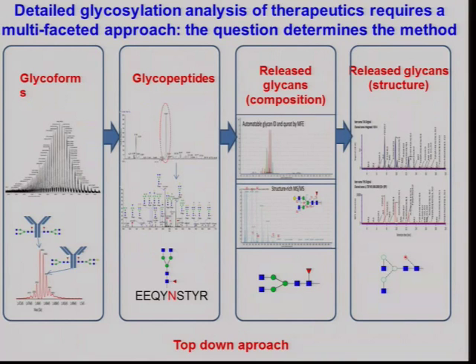This is just one arrangement of these glycans. And it will give you the site that those are attached to. So this is very helpful. It helps you to assign different structures by doing further analysis. And I'll show you these in a bit more detail in a minute.